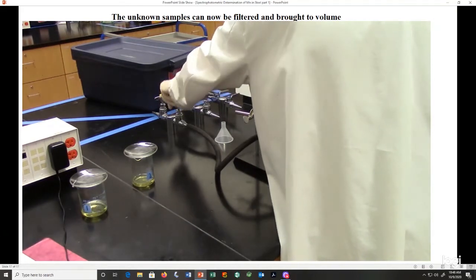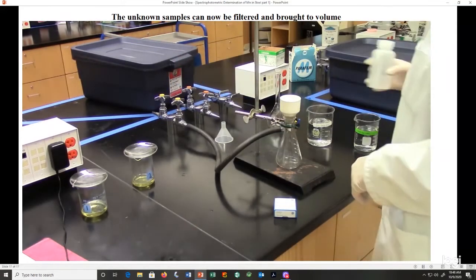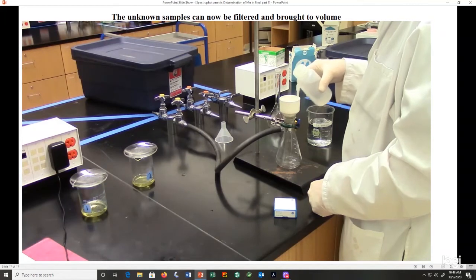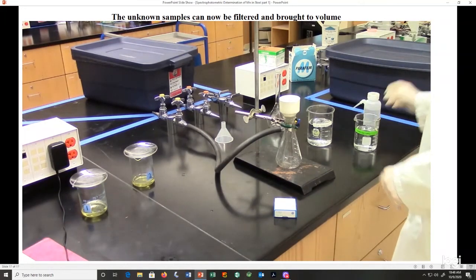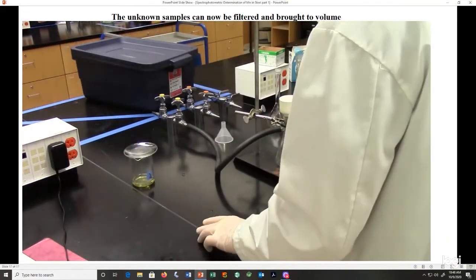So we're going to make sure that we wet the filter paper with a little water from our squirt bottle before we start. Make sure it's seated down to the funnel. And then we can start filtering our first unknown.